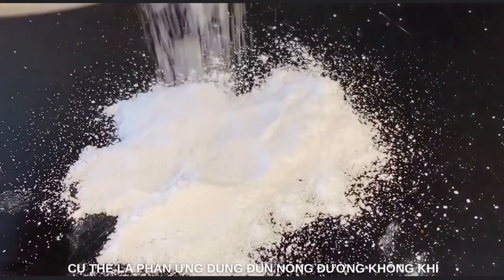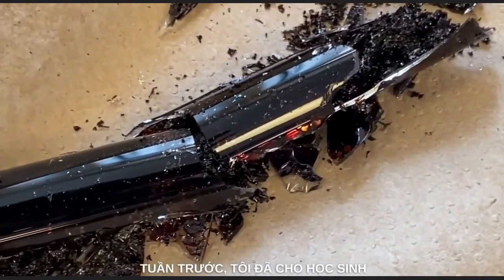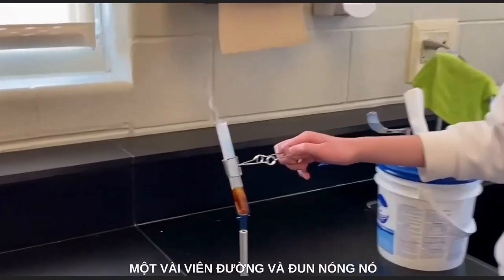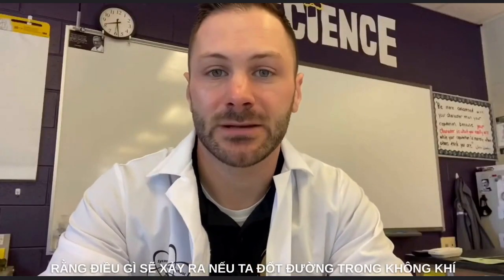Hey everybody, so we've been talking about chemical reactions in science class, and specifically the chemical reaction that happens when sugar is burned. Actually, last week some students got to do this involving a test tube, some sugar cubes, a Bunsen burner, and they took several observations to see what would happen as we burn sugar. Here's a little rundown of what happened.